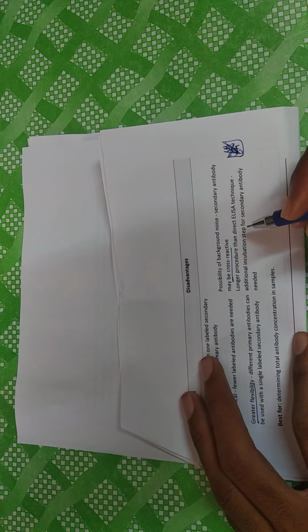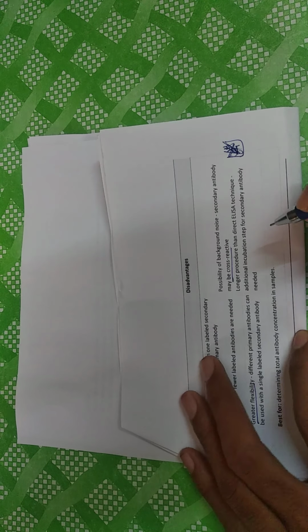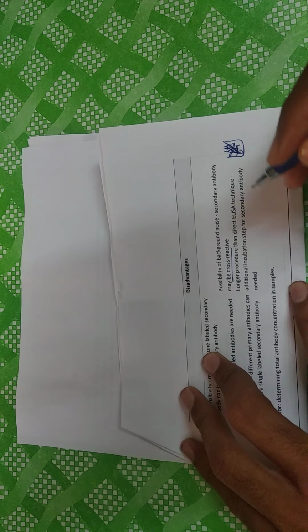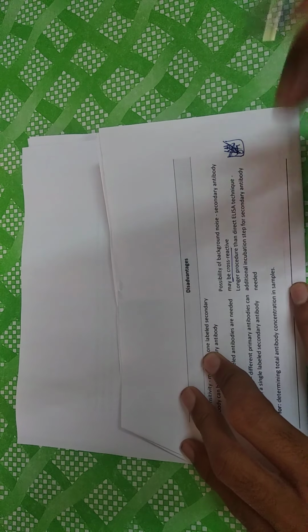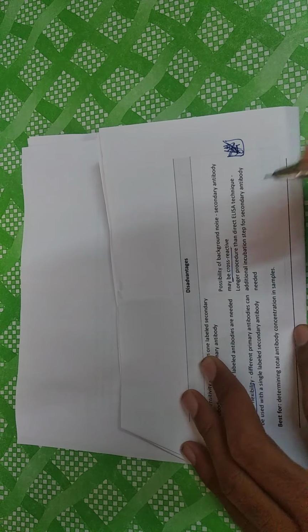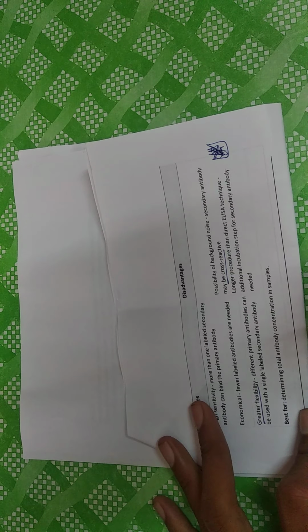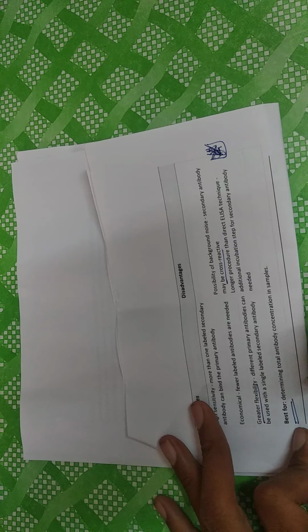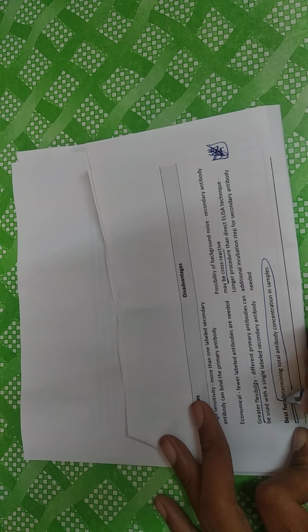An additional incubation step for the secondary antibody is needed. As I said, it requires more than two steps. It requires more steps than the direct ELISA, so it takes longer. And it is mainly used for determining total antibody concentration in the sample.